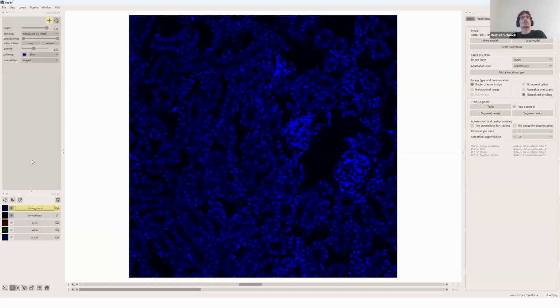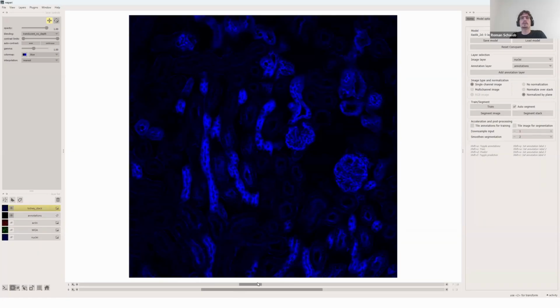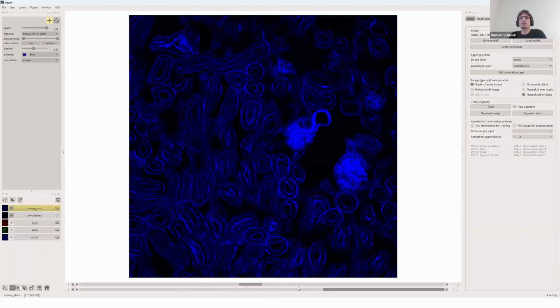And now we only have one color map available, because technically it doesn't even know which one is the channels axis and which one is the spatial axis. This is not inherently saved in the image, right? So it can't really differentiate optically between the different channels.